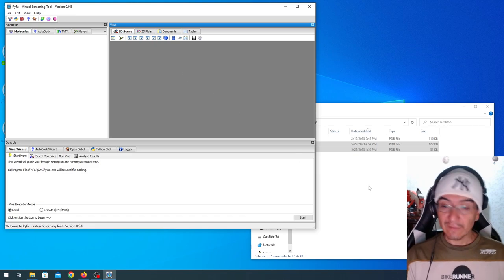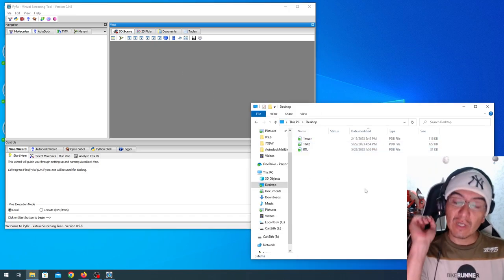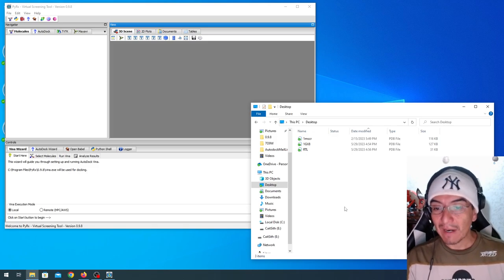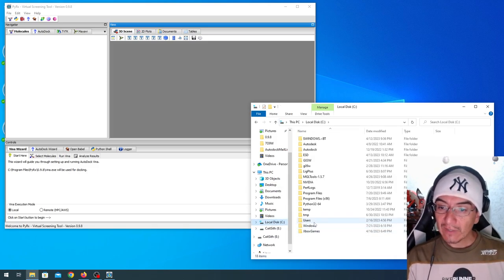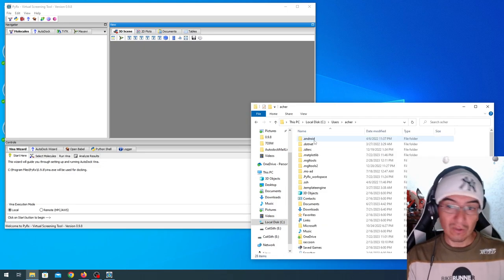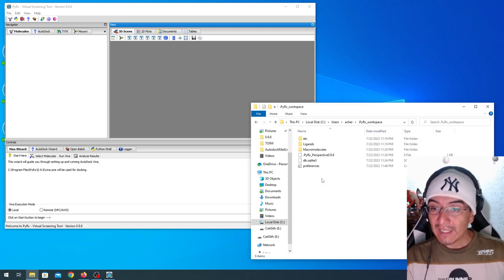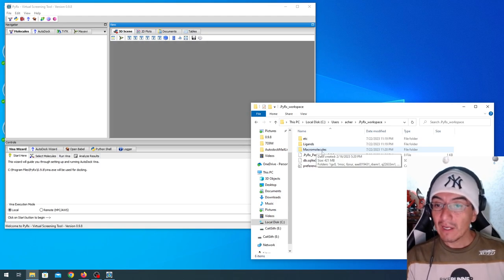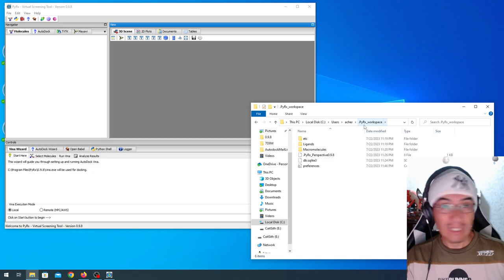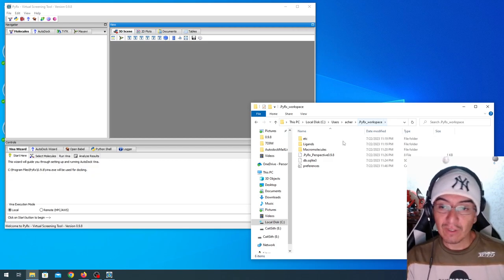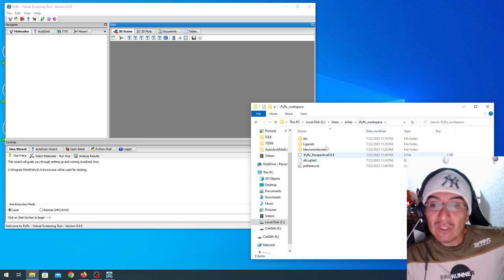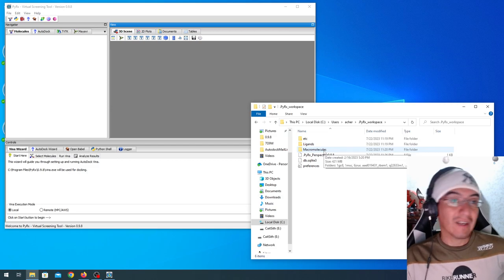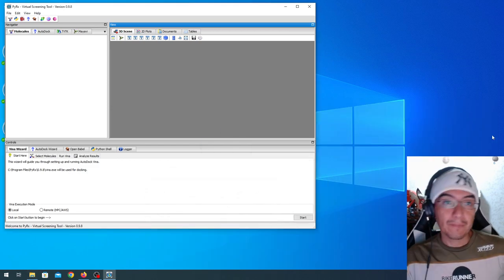Here we have the interface. Before digging into the interface, let me show you something. Once you install and start PyRx, it creates a folder, a hidden folder in your users and your username folders that is called PyRx. Inside of here, we're going to have a ligand and a macromolecule safe. This is the way it works. If your explorer is not configured to see hidden files and folders, you are not going to see this. So be careful, because here we get everything saved. Every result, every ligand, every receptor. So keep that in mind.